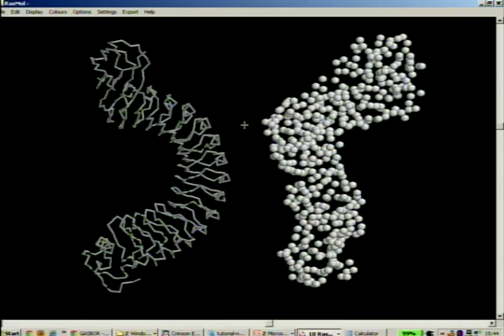This is because we do not see handedness in SAXS, and if you would repeat the process of the GASBOR modeling, you will get very similar models, but they could be mirror images of each other. And in SAXS there is no way to see which one is correct. Usually, if you do not have a way of resolving the handedness, you just ignore that, and any journal would accept the SAXS model with the note that the handedness is not known.